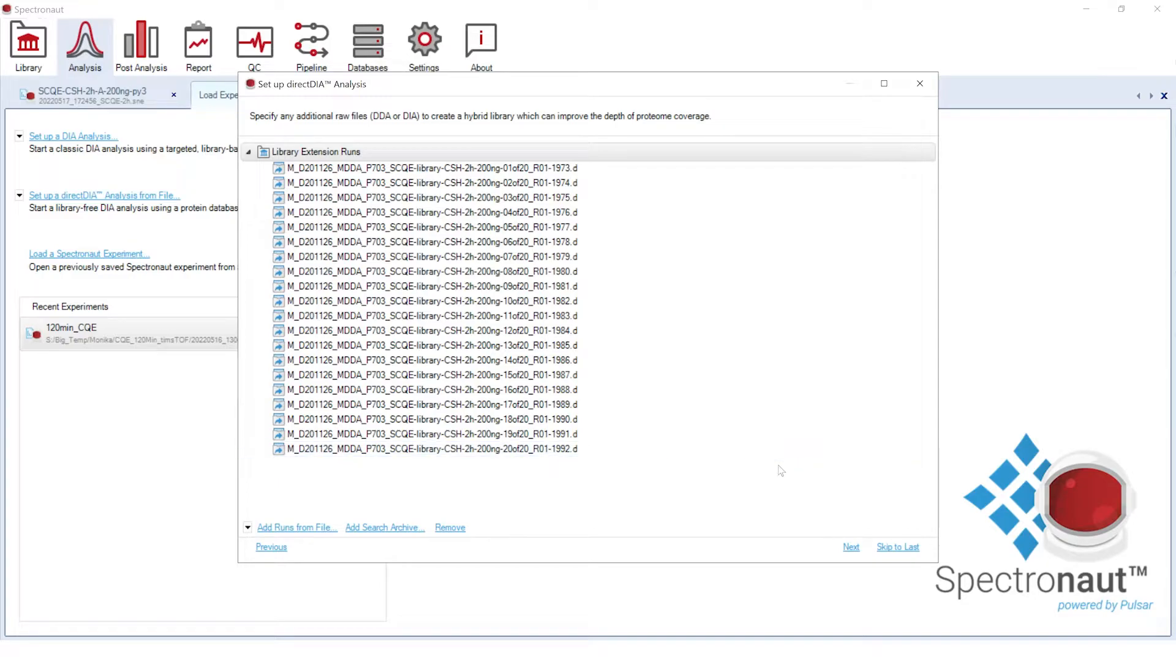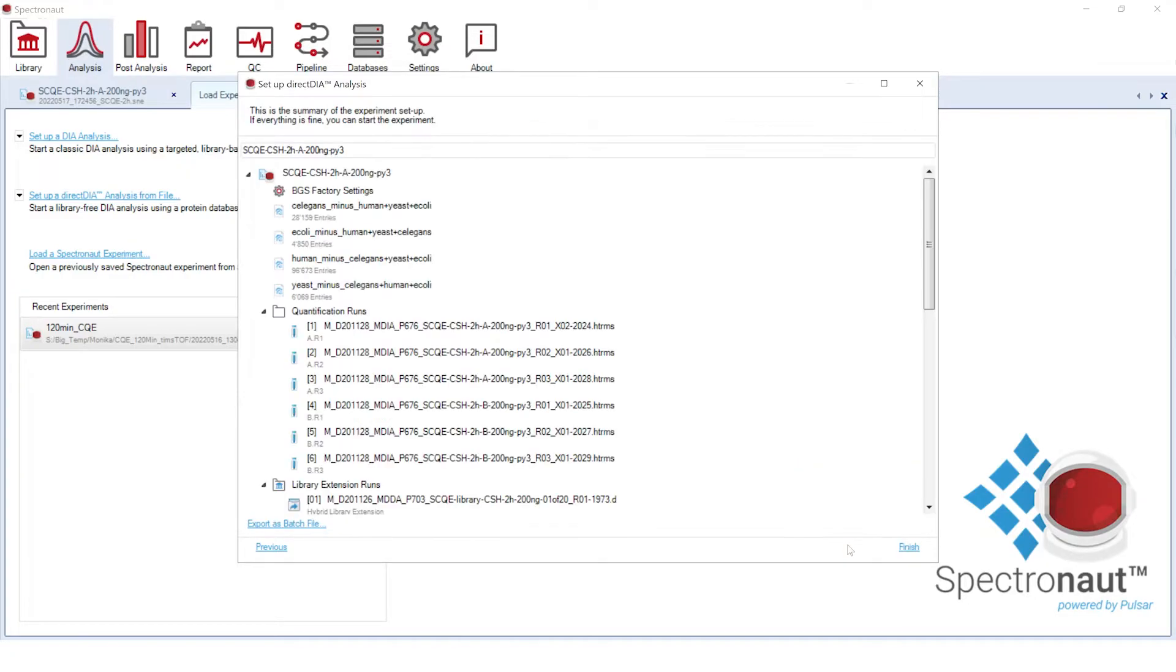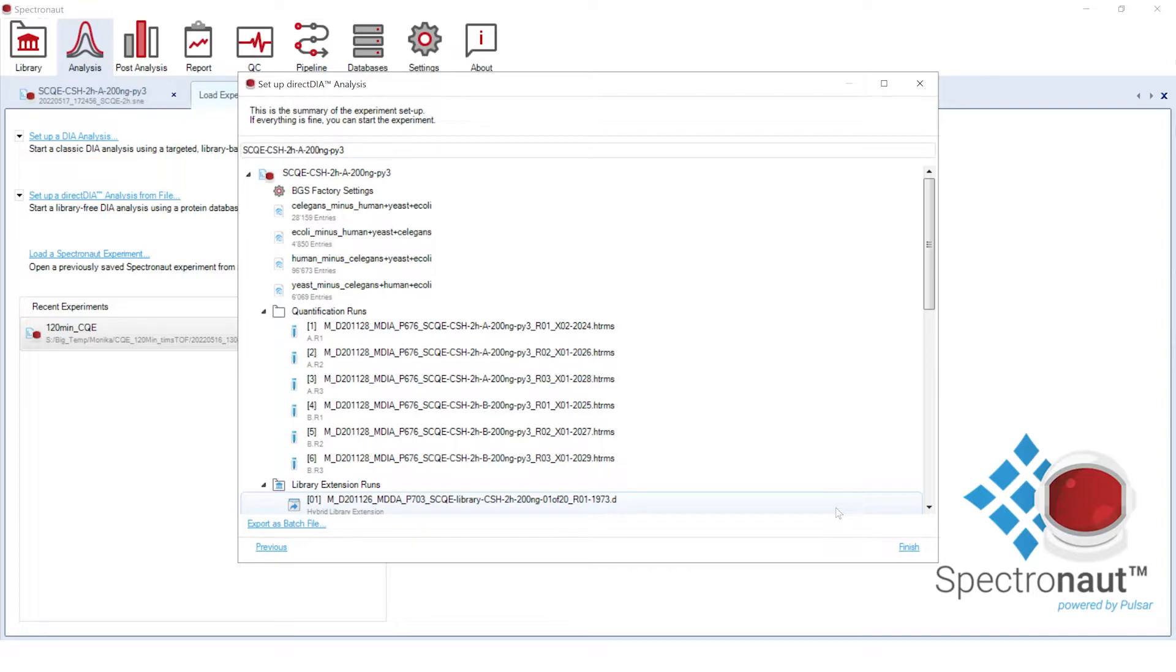Now we are ready to start the analysis. By default, Spectronaut will also generate search archives from the Pulsar search performed for this analysis. Those search archives will be available to enrich spectral libraries of future experiments.